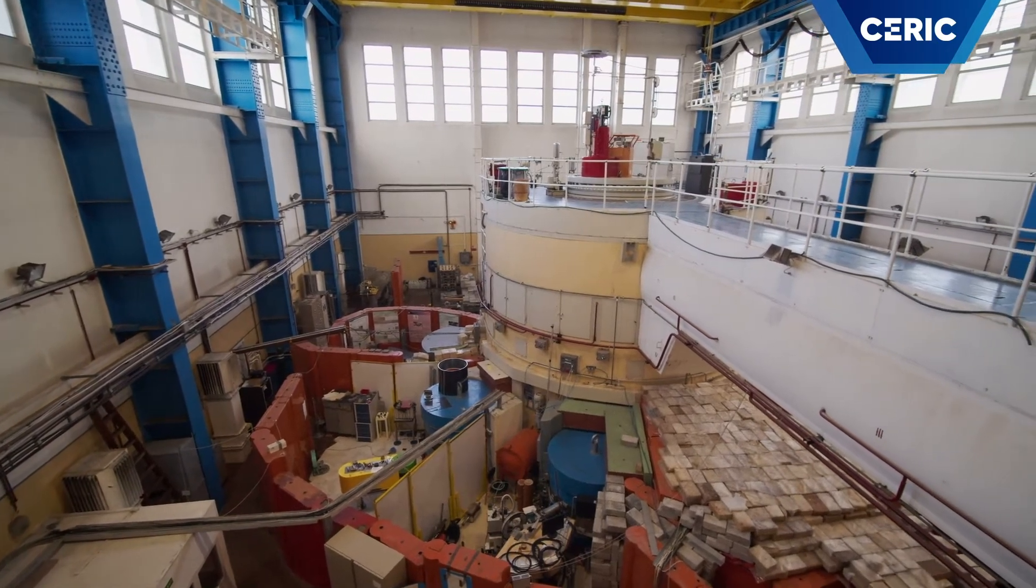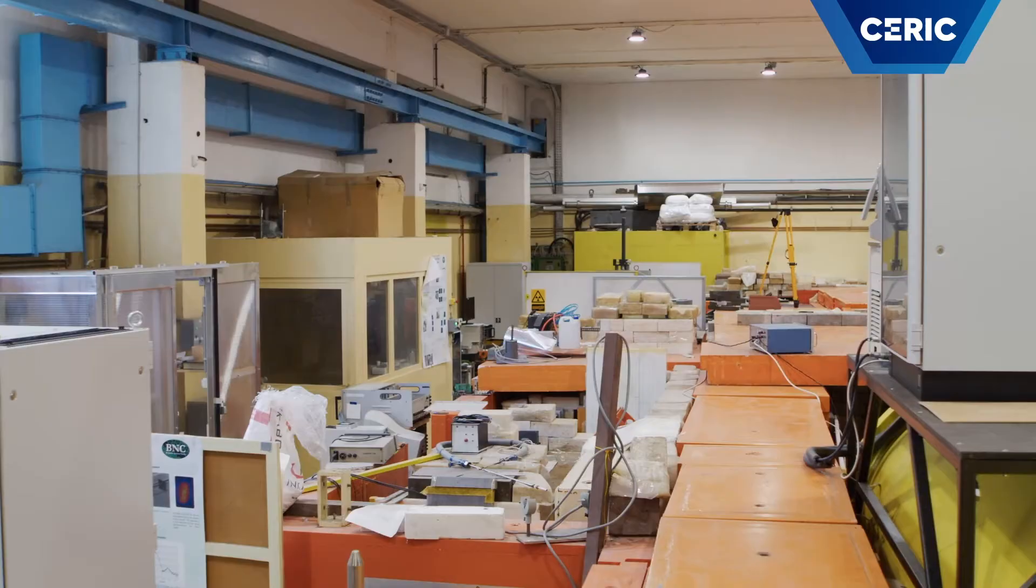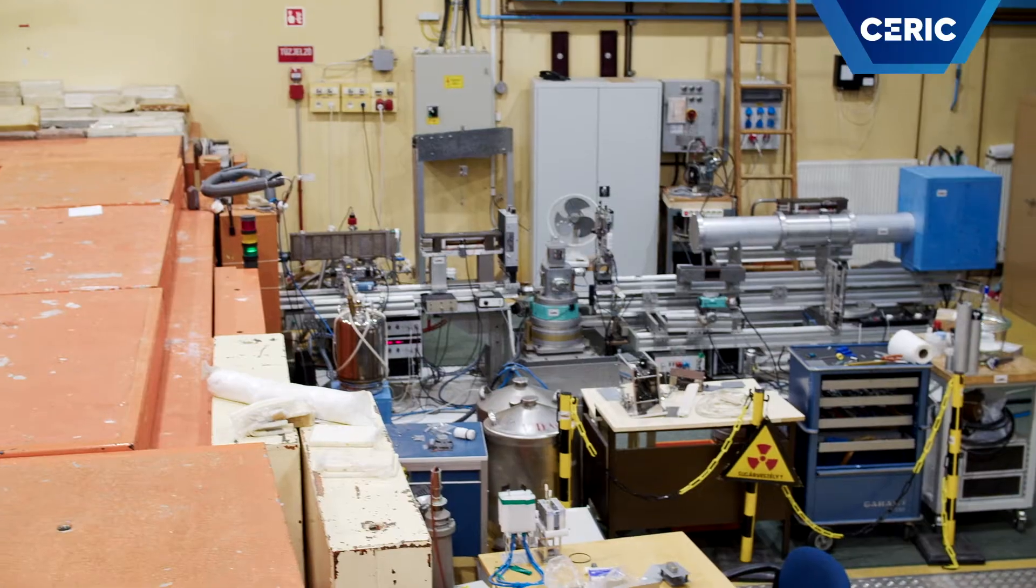Welcome to the experimental hall of Budapest Neutron Center, which is the most significant research infrastructure in Hungary and the neutron service provider of CERIC ERIC.